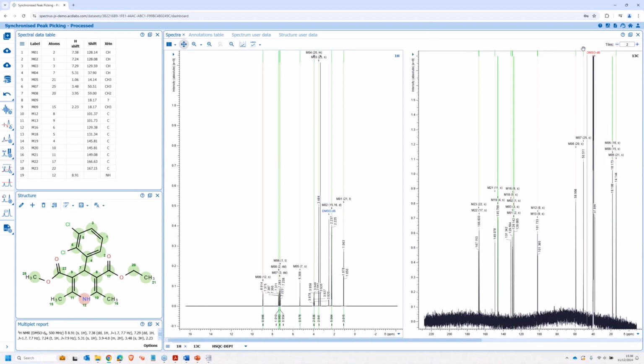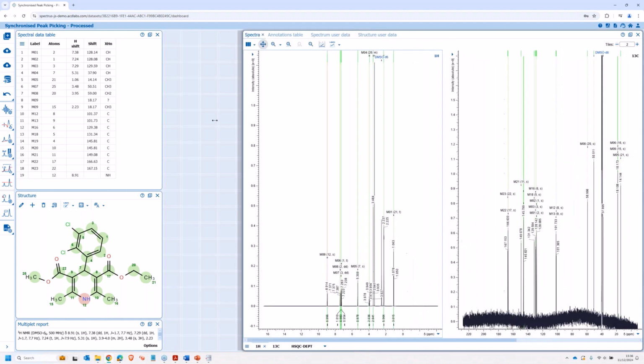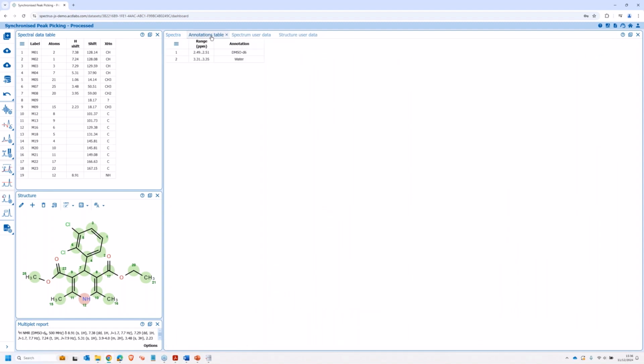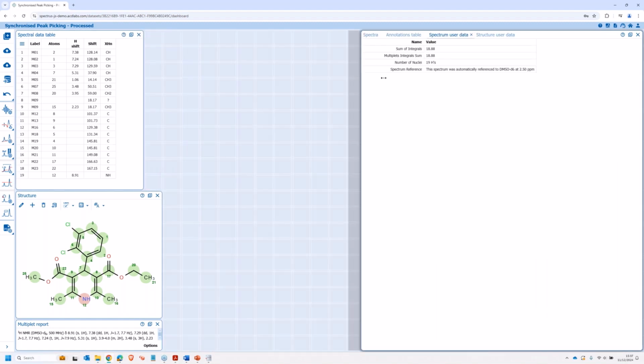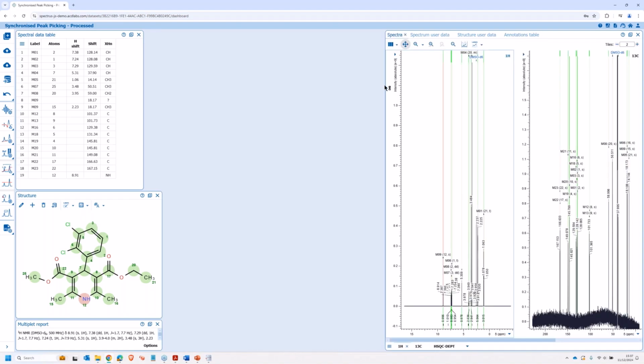And the way it's laid out is that these are in kind of widgets. So you can click and drag and resize these widgets as you wish. You can make them bigger and smaller. You notice in some of them, we have some little tabs here. We can expand these. We can pull these tabs out. We can move them around. So it's very flexible in how you set this up. It's really up to you and your own personal preferences and how you view the overall layout of here.